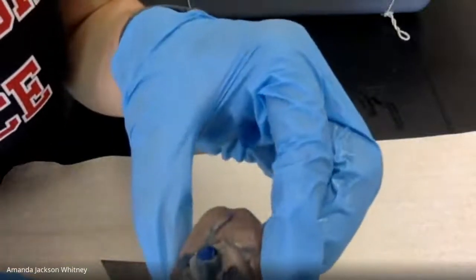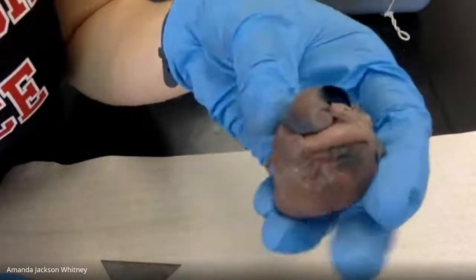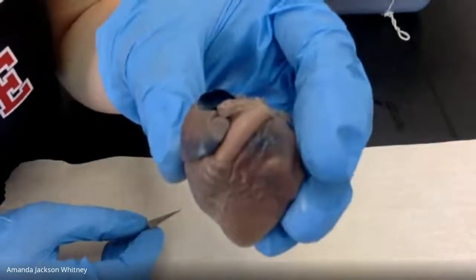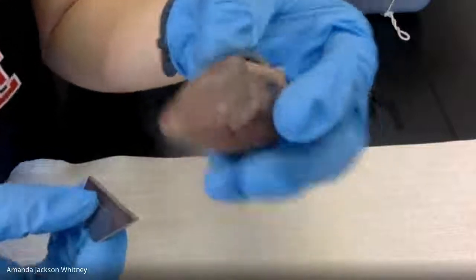Any questions on anything on the outside before I start cutting into the heart? It's kind of cute, right? Oh, maybe not. I think it's pretty cool.